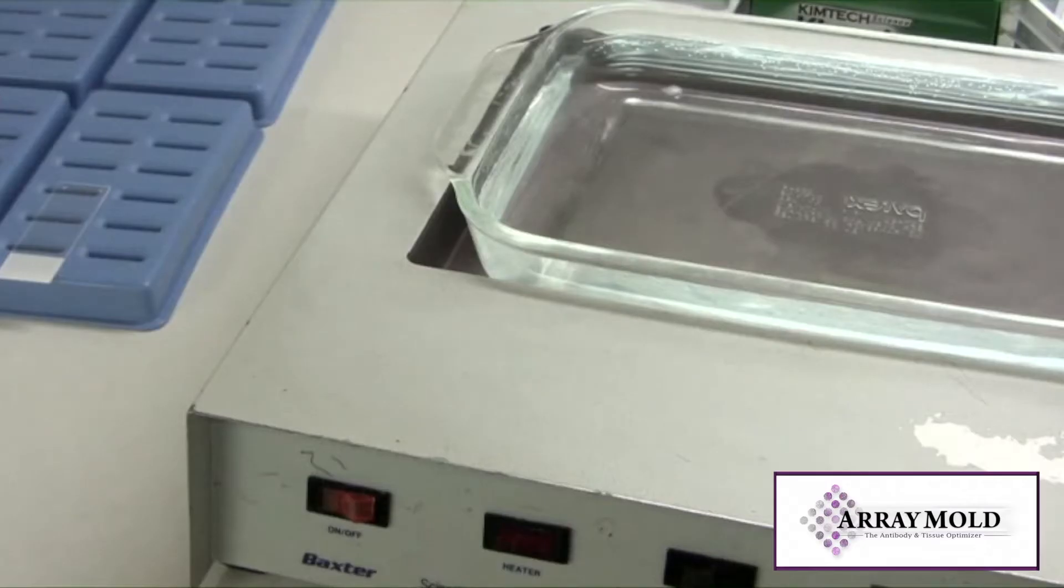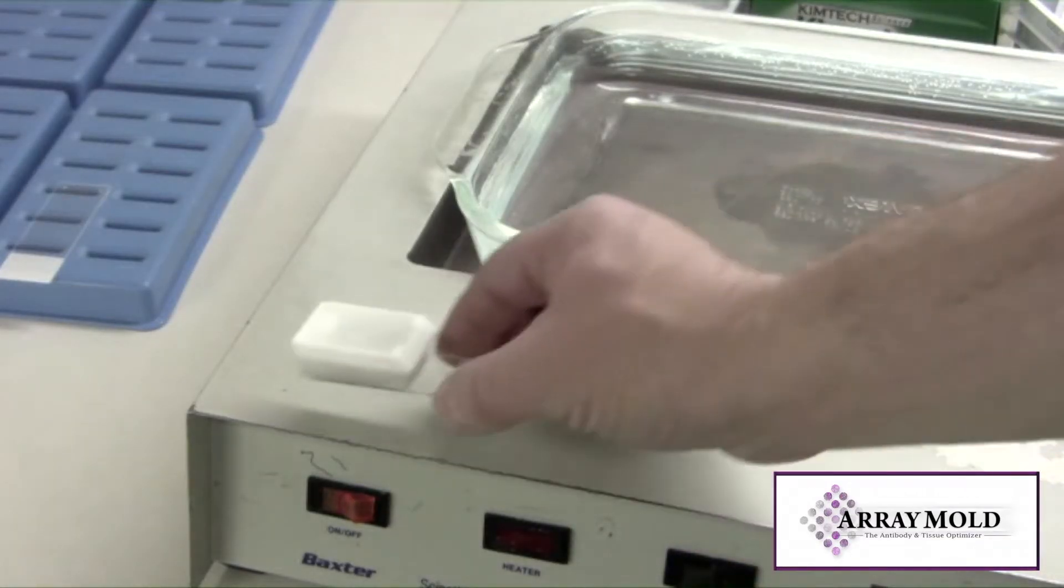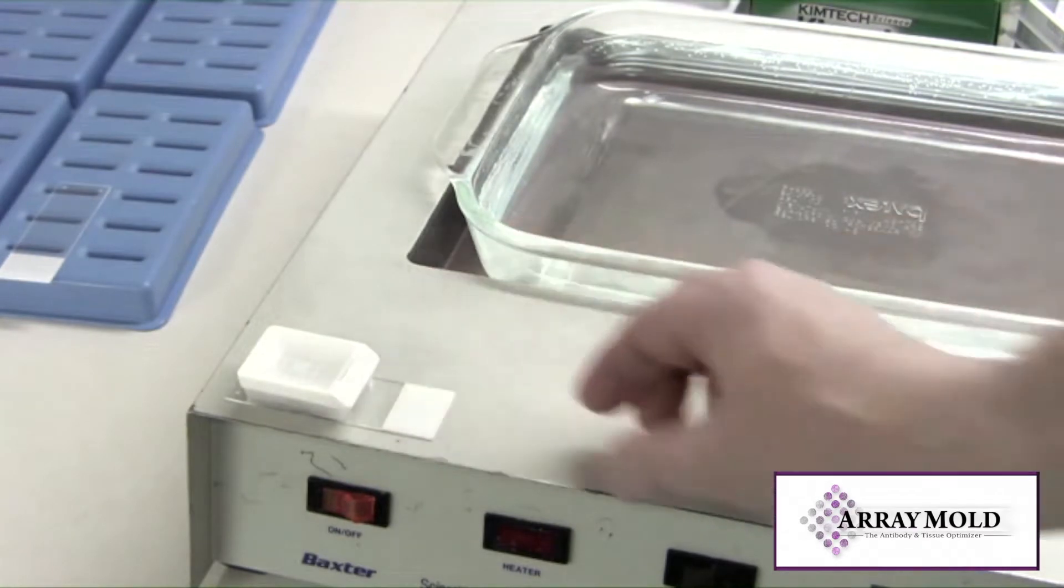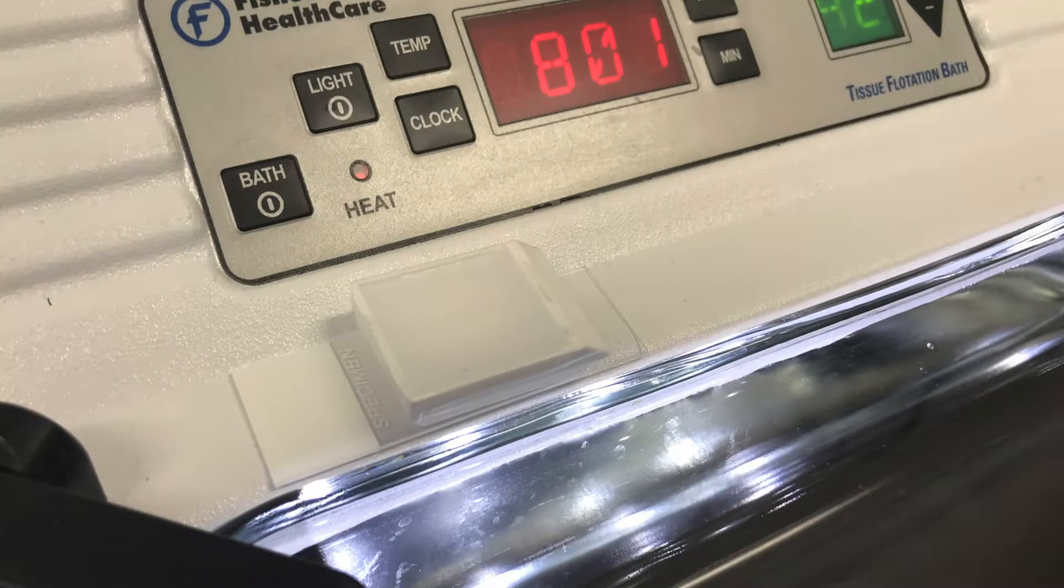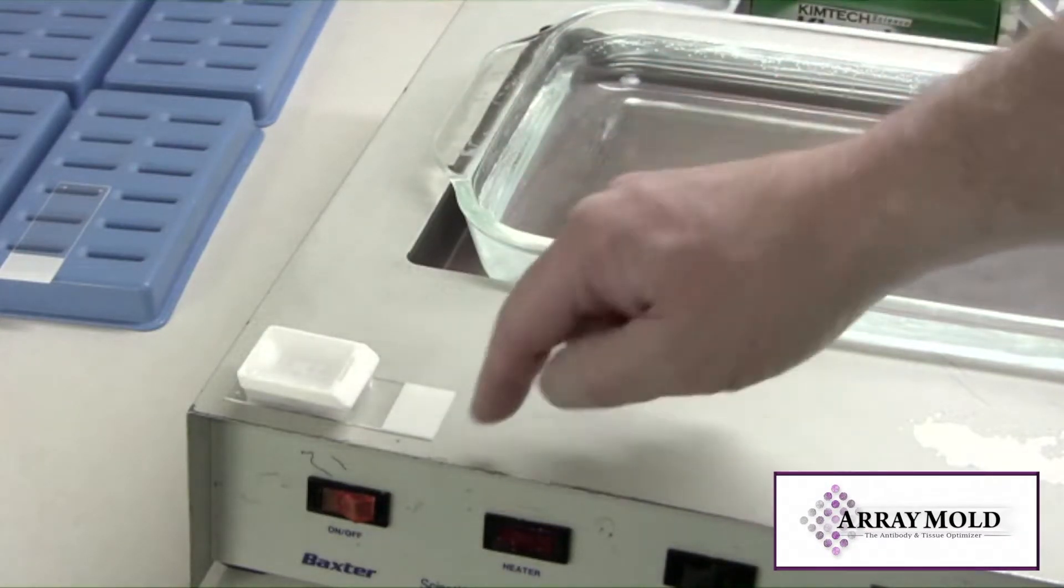Since I only have one oven, the array mold block still needs to stay warm and soft while the single slide heats up. I'm placing my array block on the side of my water bath. It's warm enough to keep the block soft while the single slide is heating up.